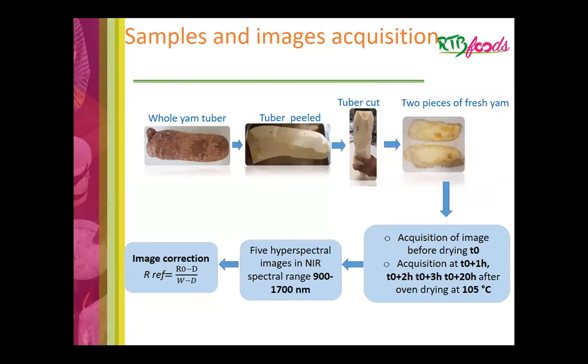For this study, we used the young tuber that we bought at the market at Montpellier. These tubers were peeled, washed, and then cut into 2 longitudinal pieces. We use these two pieces.